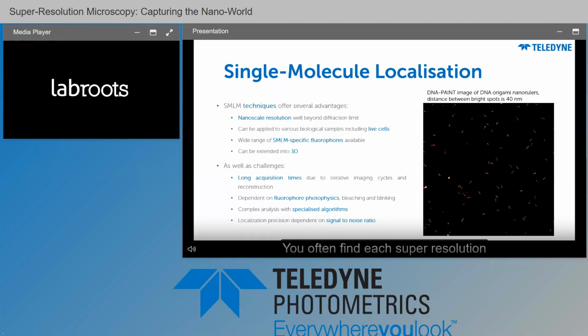You often find each super-resolution lab has its own algorithm it'll be using for reconstruction or analysis, and this can mean differences between them. And the localization precision is entirely dependent on the signal-to-noise ratio, so it's very important that you have a sensitive imaging system and sensitive camera in order to capture the ground truth and not just noise.